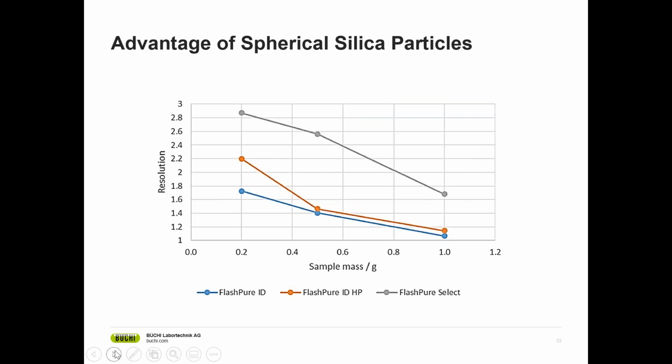The diagram shows the resolution obtained as a function of loading for different cartridges. As expected, resolution at the lower loadings is essentially a function of particle size. For higher loadings, the resolution decreases strongly. The optimum loading for an efficient and economical separation of a mixture of substances depends on so many factors, such as the chosen solvent system and gradient, the amount of target compound and the impurities in the sample, and the resolution at lower loading. The better the initial separation, the more sample can be loaded while still obtaining satisfactory separations.